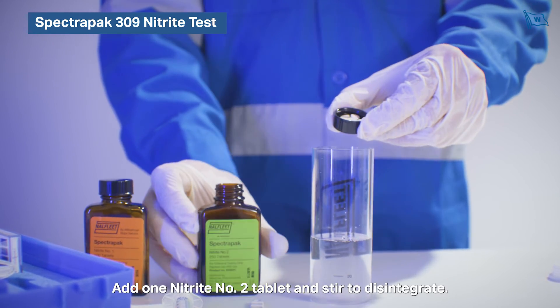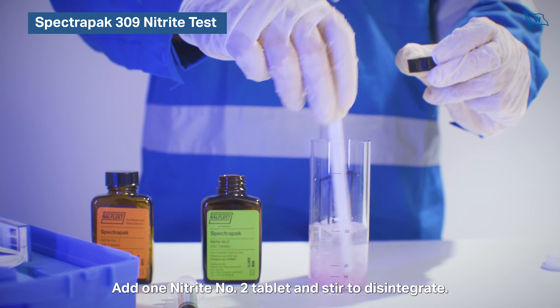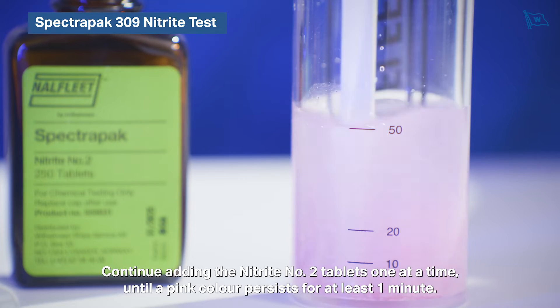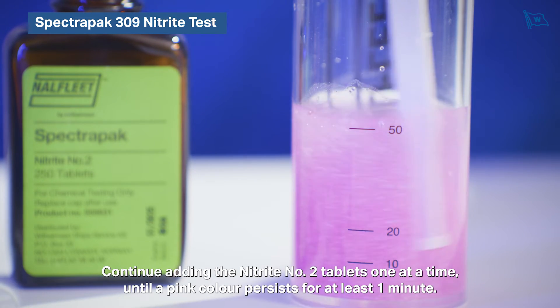Add one nitrite number two tablet and stir to disintegrate. Continue adding the nitrite number two tablets one at a time until a pink colour persists for at least one minute.